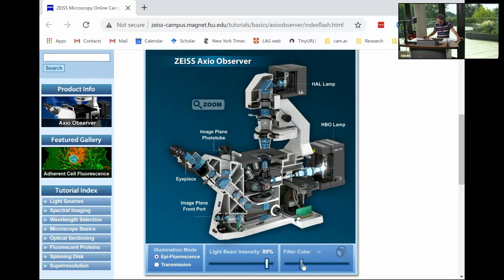I can select, you can see I'm turning the filter cube now. So for example, here, I've now switched it, so I have a different emission color selected. So that's a green color. You see, blue goes in and green comes out. If I select this one here, 550 nanometers, green goes up to the sample. You can see green goes up and red is passed through. Or you can excite with orange or a reddish light, and then deep red light comes back in fluorescence. So that's really what you might have in a microscope in the laboratory.